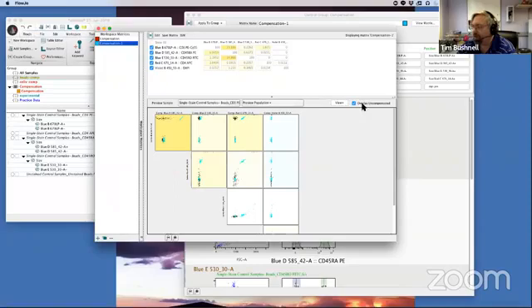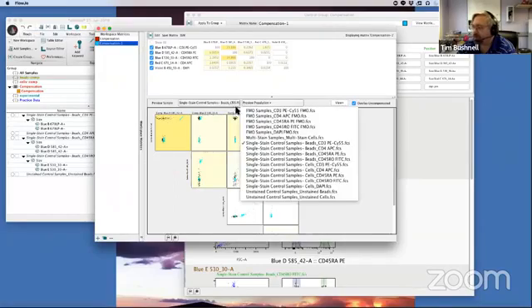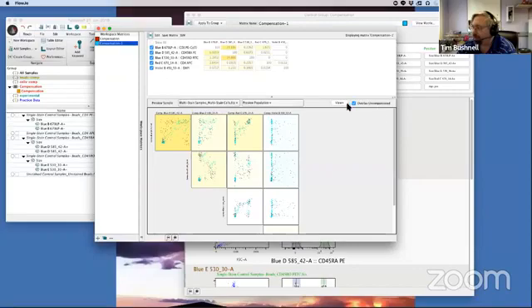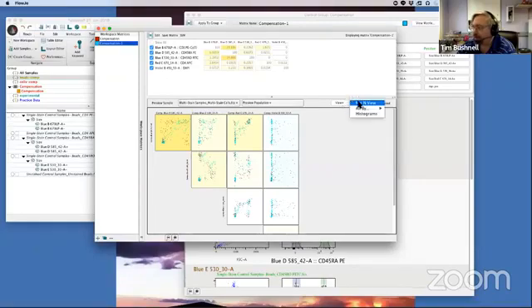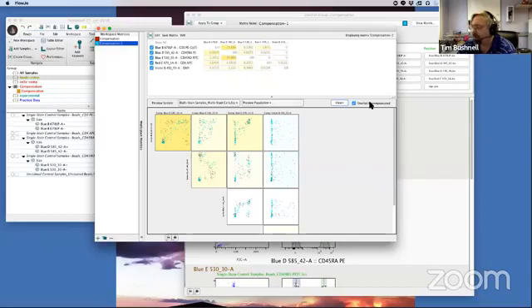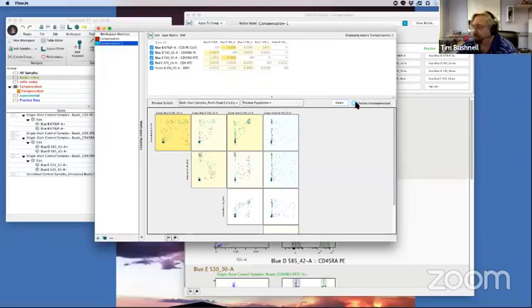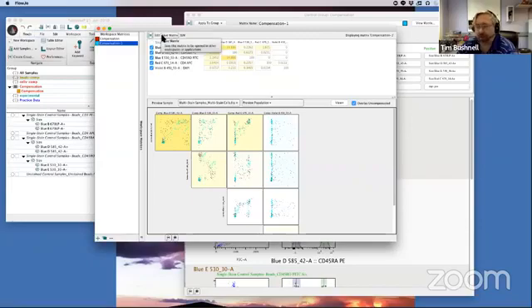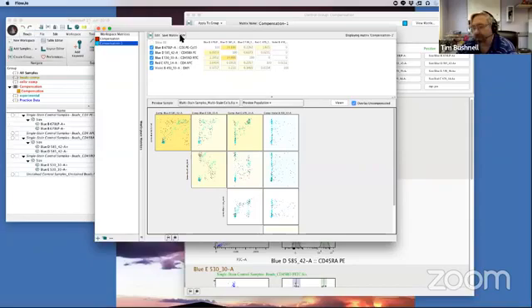Down here we're seeing our unlay and our overlay. So we can change whatever sample we want to look at. Here's our multicolor sample. And we can compare all by one color, the end-by-end view, which we have here. And if we remove this, you can see the black is compensated. The blues are uncompensated. This is a matrix we can now apply to any of our groups over here. We can actually save the matrix we want.